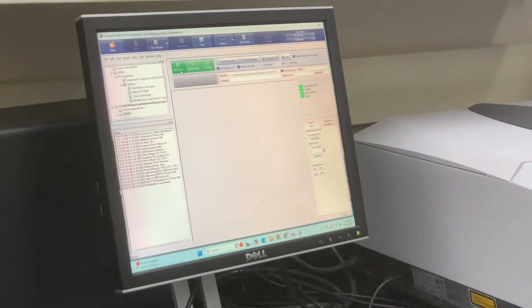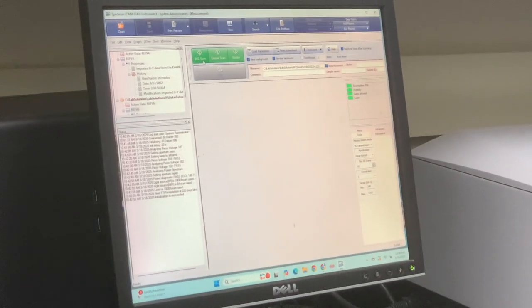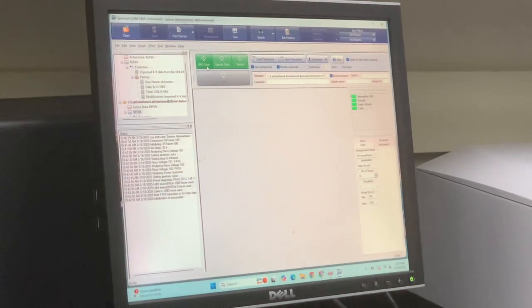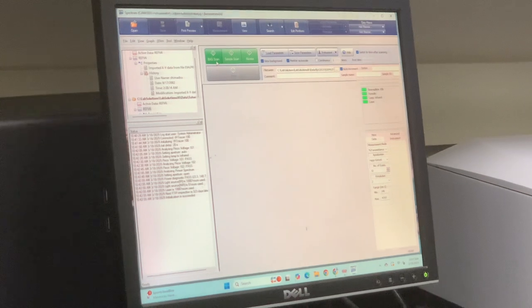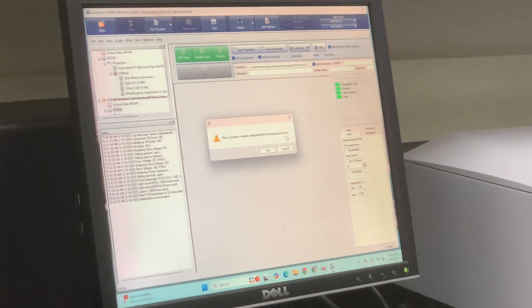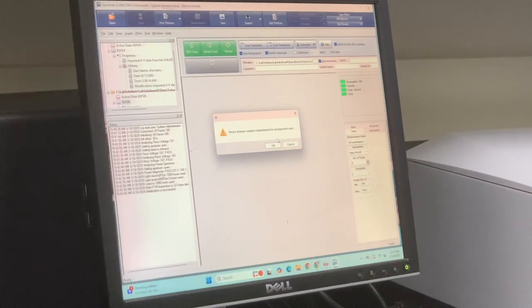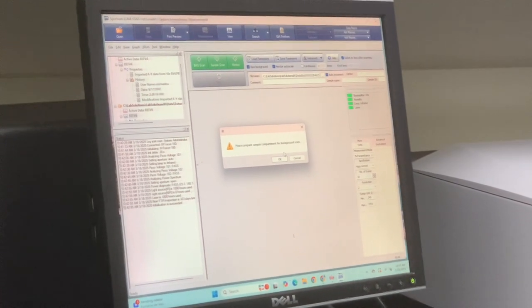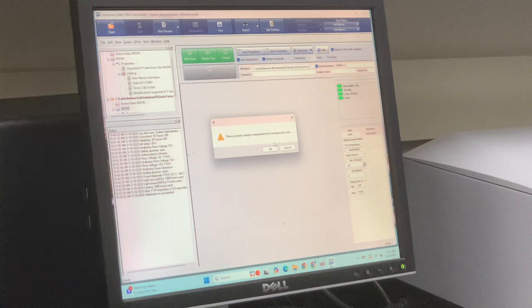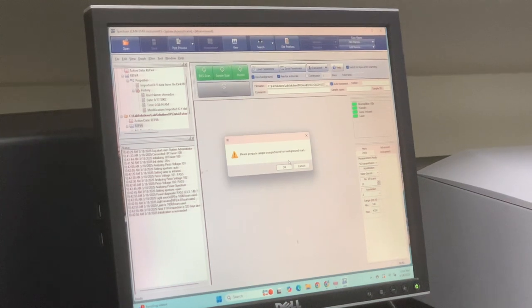BKG is for background. Basically you want to have a starting point. So you run your background scan to see if there's any kind of noise that's consistent, and then when you put yours in, it'll subtract that out. May I ask, if we find any noise after running a background check, is there a button that will reset everything so that it goes to 0? You're basically subtracting the background spectrum from yours. You don't need it at 0, just the subtraction, then you've got what you need to measure.